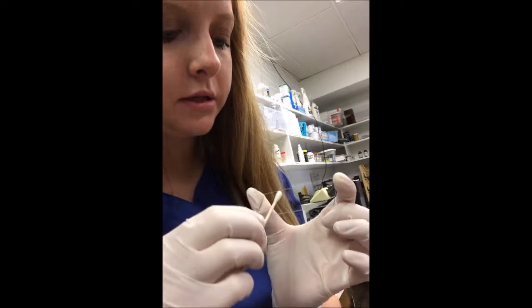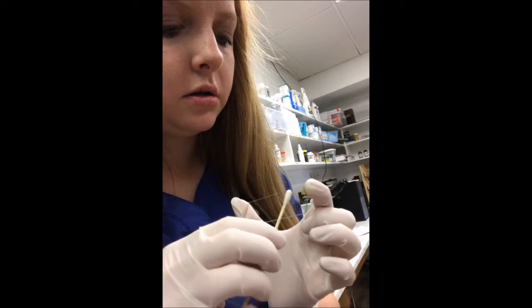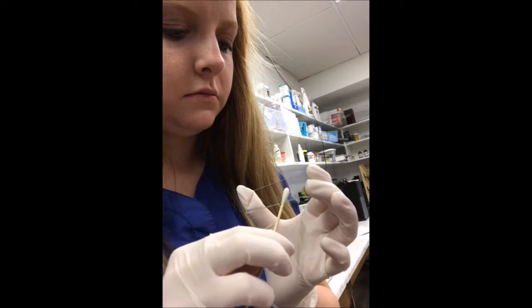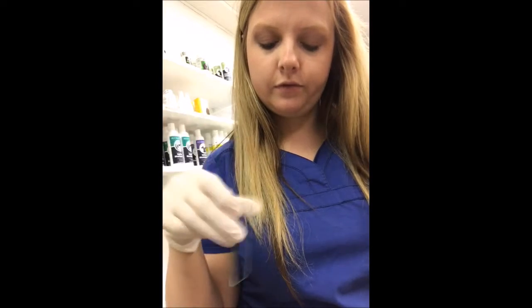I'm going to roll it in single layers on this slide. Okay, we'll let it air dry for a minute. Just going to wave it gently in the air.